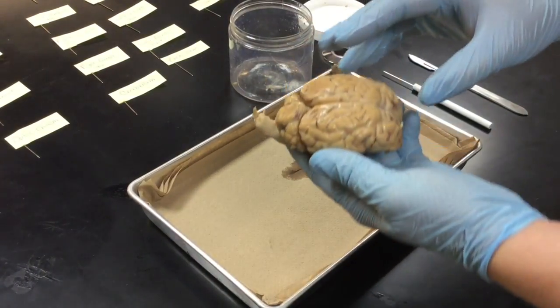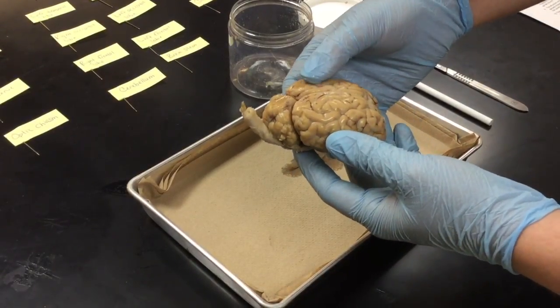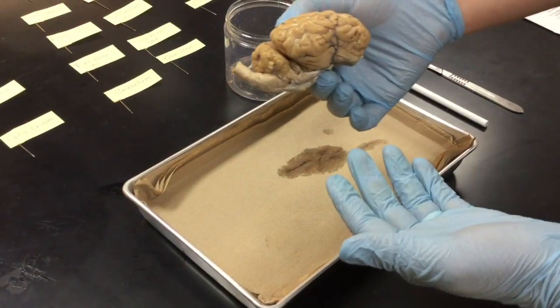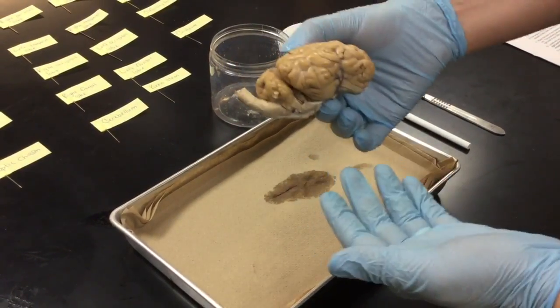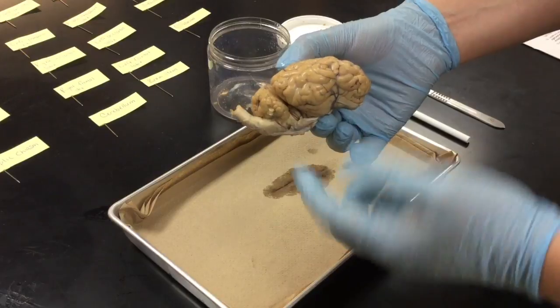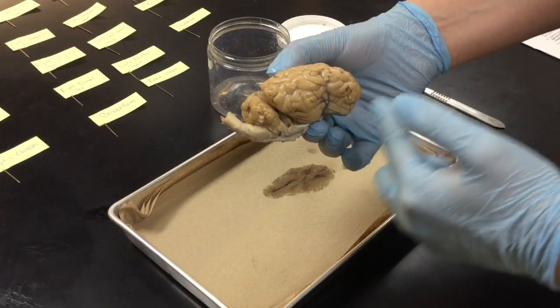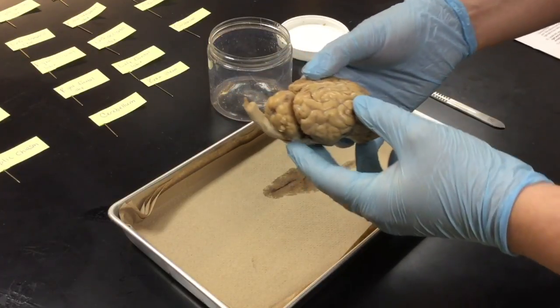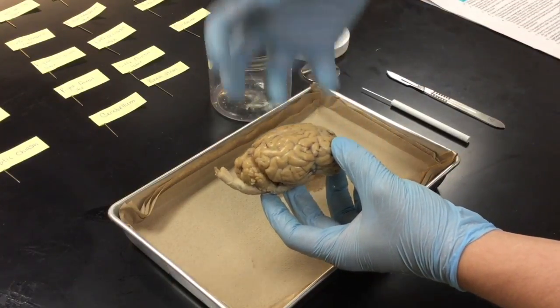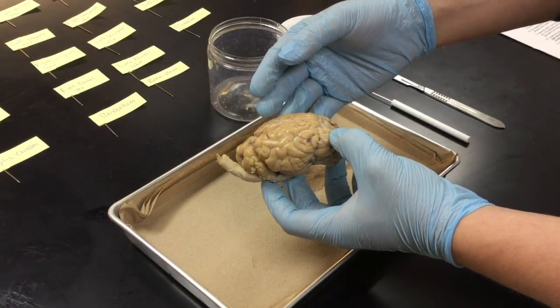So once you look at the sheep brain, what you notice is that you'll see these individual different folds. Those folds are designed to add extra area, extra nervous tissue. Now the brain is very special. It's the only organ inside of our entire body that's going to process information. It's going to then send a signal back telling our body how to respond. So each of these different parts of the brain represent a particular function that's going to be carried out in that particular region. So your objective is going to be identifying those various different parts of the brain, and then we're going to see what function they are going to have within our body.